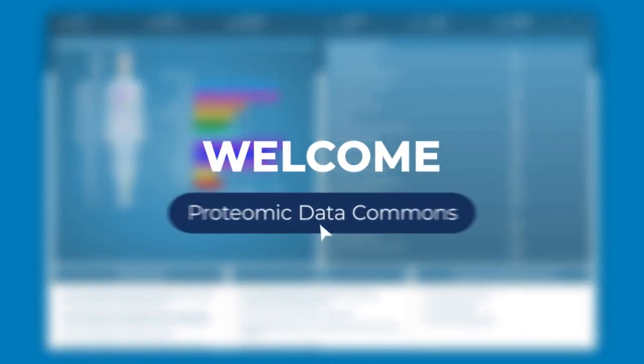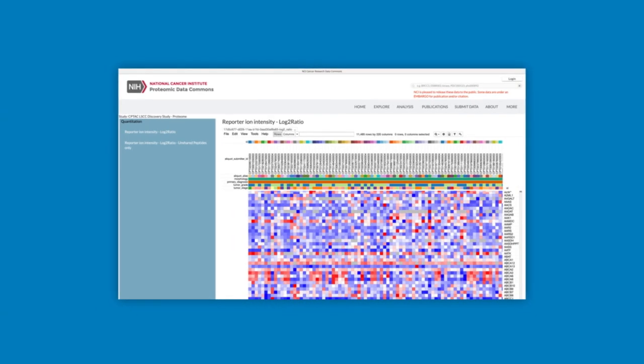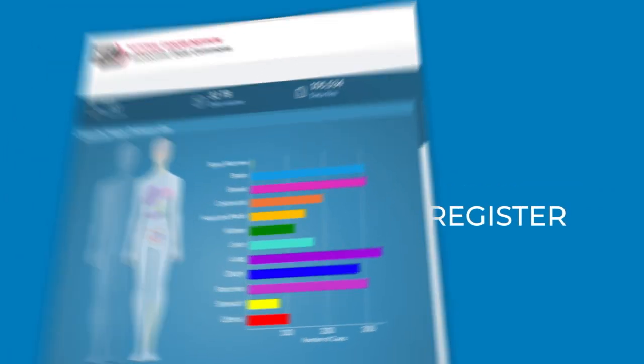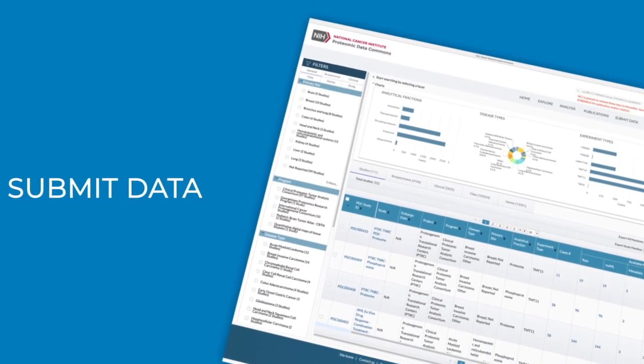Welcome to Proteomic Data Commons, NCI's cloud-based proteomic data repository. Through this series of videos, we'll help you register and learn how to submit data through the PDC data portal.